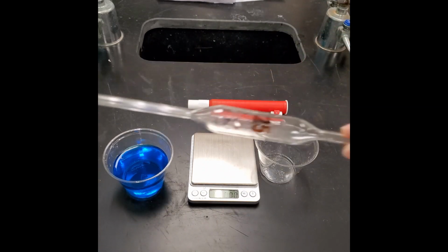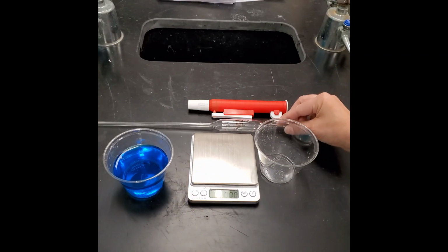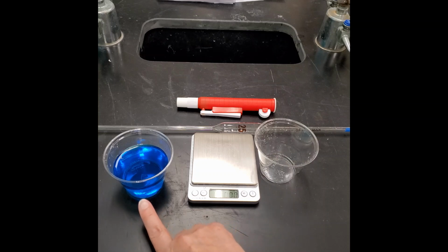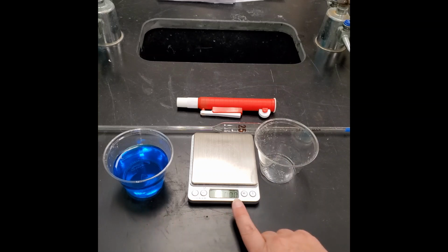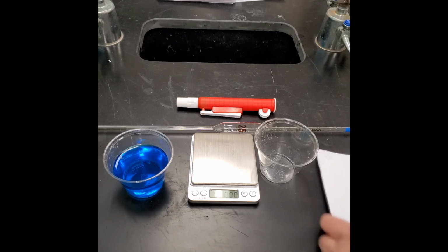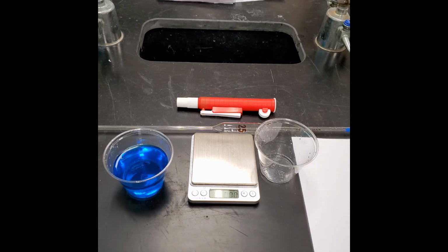Now the equipment that you're going to use, we have our pipette. This is a pipette filler, and I'm going to show you how to use it. You're going to have the solution that you're going to test, whether it's your reference solution or the unknown solutions. You're going to have a balance, and you're going to have a cup, something to contain the liquid to deliver into. And then you're going to have your spot where you can write your data down.